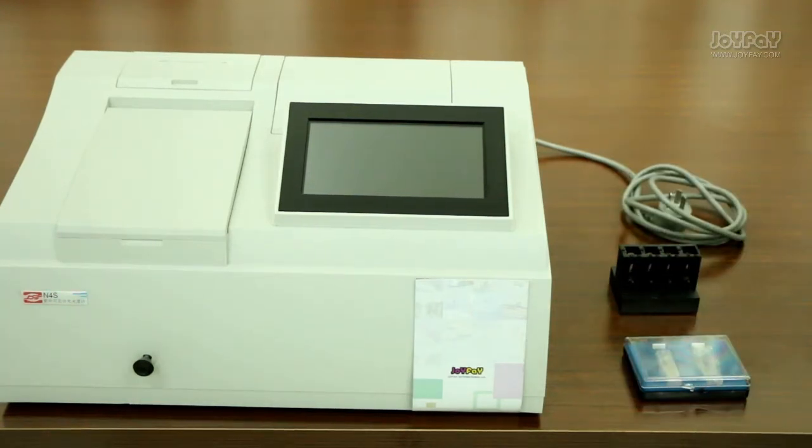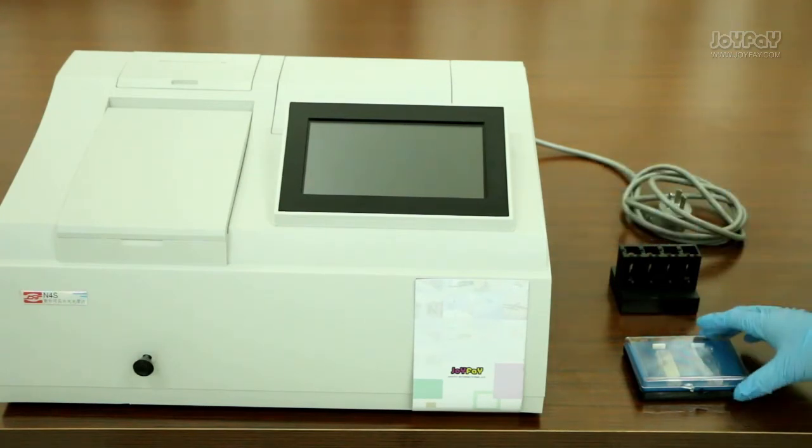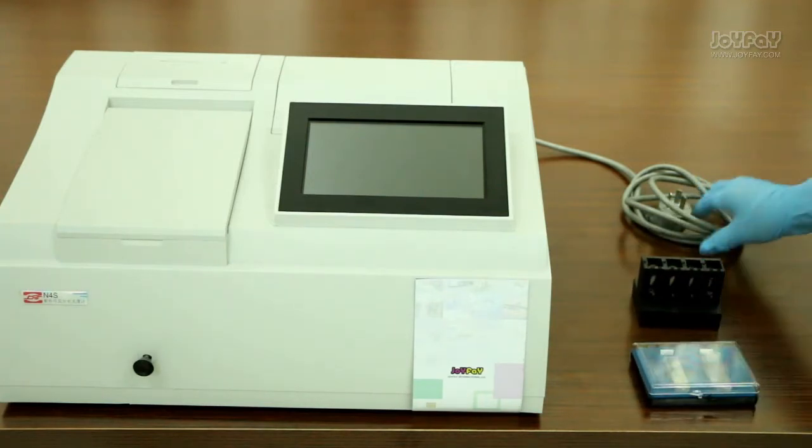First let me introduce the components to you. Here we have a main machine, two cuvettes, a cell holder, and a power cable.